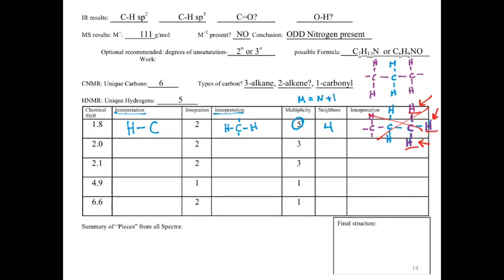That's a pretty big leap, but hopefully you can see how we went through and did that. So we draw out our 2 possible structures. Hopefully we only end up with 1, but sometimes we get multiple. And then we evaluate what we know about that structure or that piece that we've put together. And in this case, we know that it would have to have a 3 hydrogen signal, which doesn't show up in our spectra. This means that piece does not work, and I can now erase that. And I would transfer the other one in, but I don't want to draw it again.